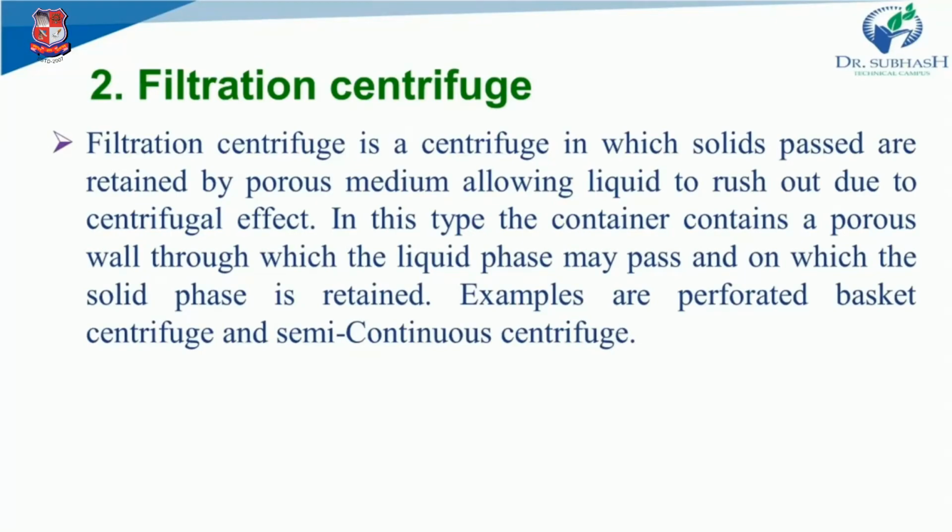You must have also performed filtration practicals or experiments at lab scale, right? So this is a really simple principle. This is a really simple centrifuge, and examples are the perforated basket centrifuge and the semi-continuous centrifuge.